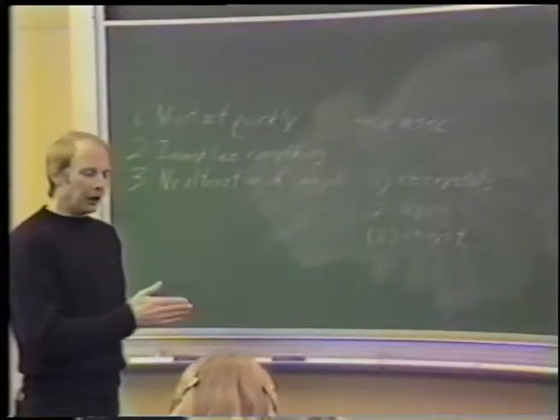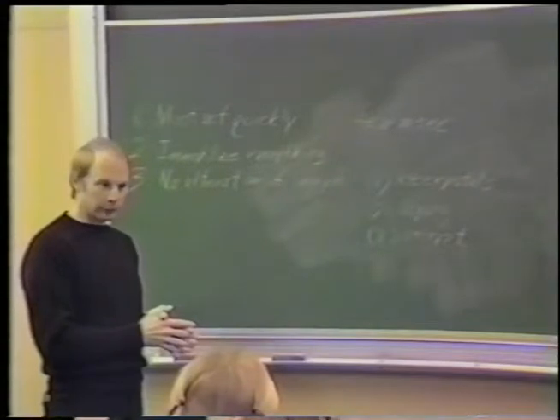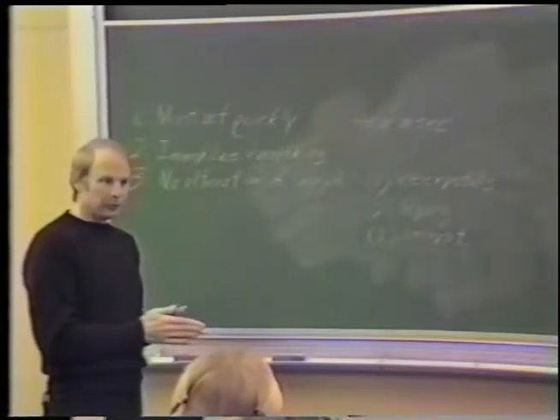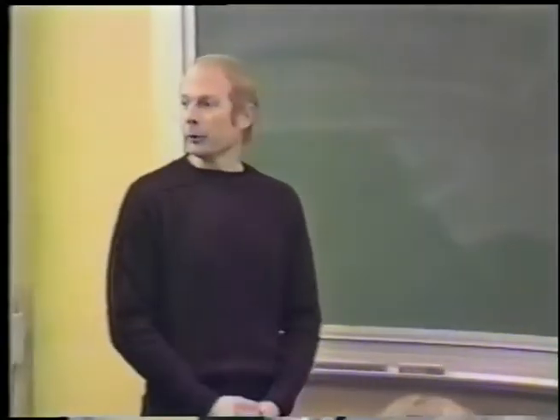Essentially, until the sample has been processed by freeze fracture, if you're doing that, or the sample has been completely substituted, you want to keep it below that. Even that isn't rigid. Yeah, we'll go into that. Okay. Now I'm going to talk about the methodology of ultra-rapid freezing.